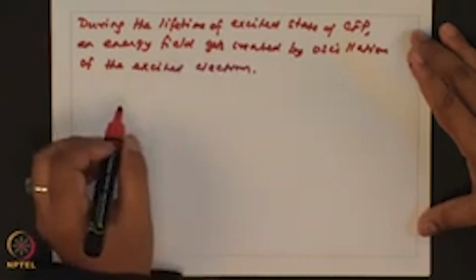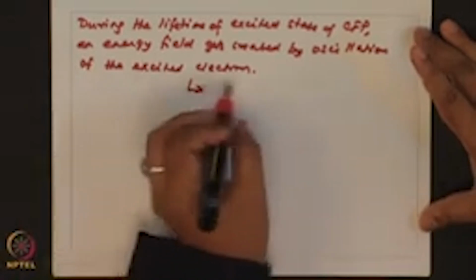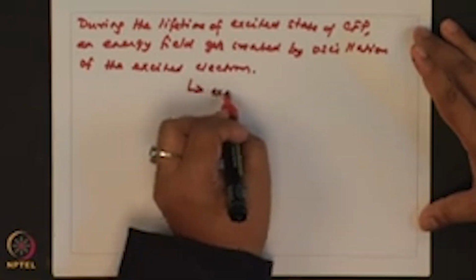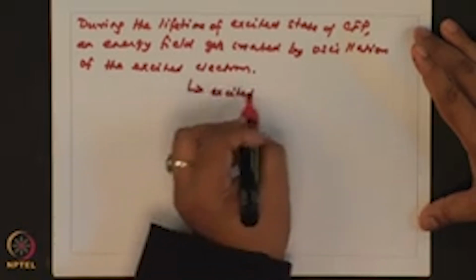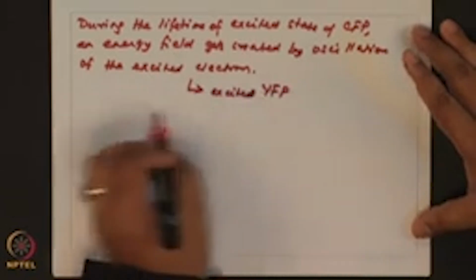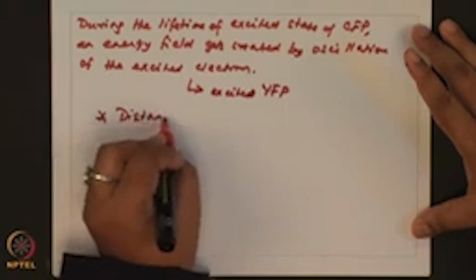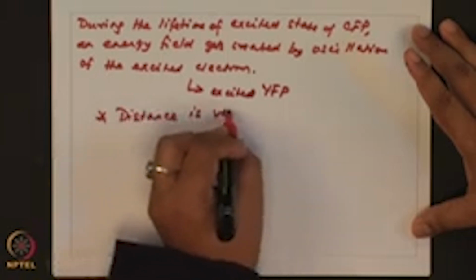This energy can then be used to excite YFP, provided, and there is one clause, the distance is very low.